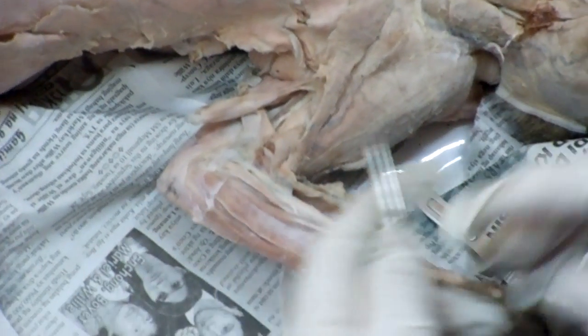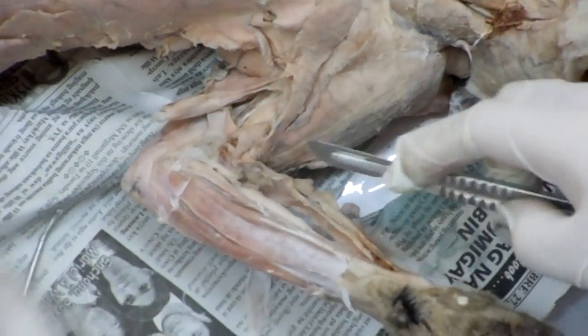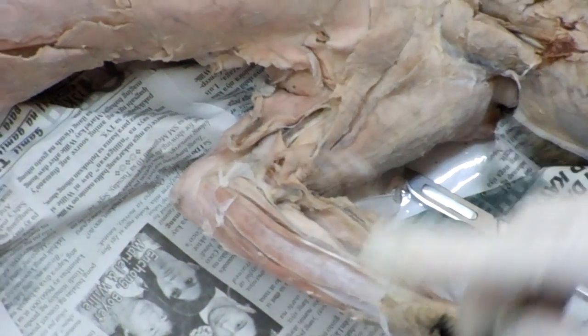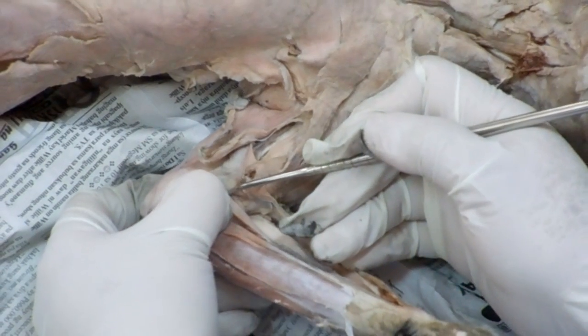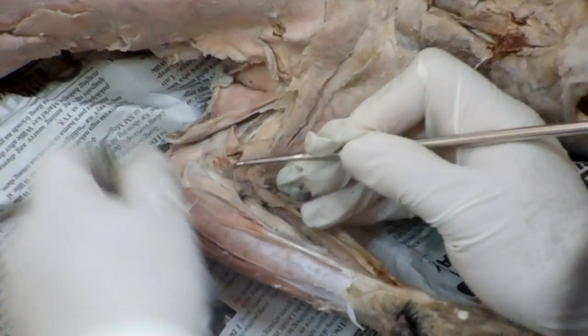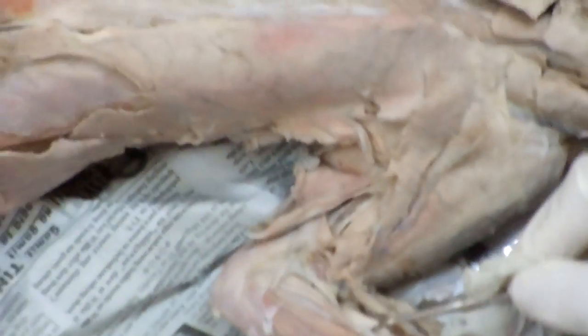Next, pronator teres. This is next to the extensor carpi radialis longus, and somewhat underneath it. It has a broad upper end that slants to a narrower lower end. Origin: medial epicondyle of the humerus. Insertion: broader anterior radius, and it narrows posteriorly. Hindi ba kaya nyo naman sila? Okay, so ito na siya. Ano nga tawag dyan? Pronator teres. Ano nga ulit itong muscle na ito kanina? Extensor carpi radialis. Okay.